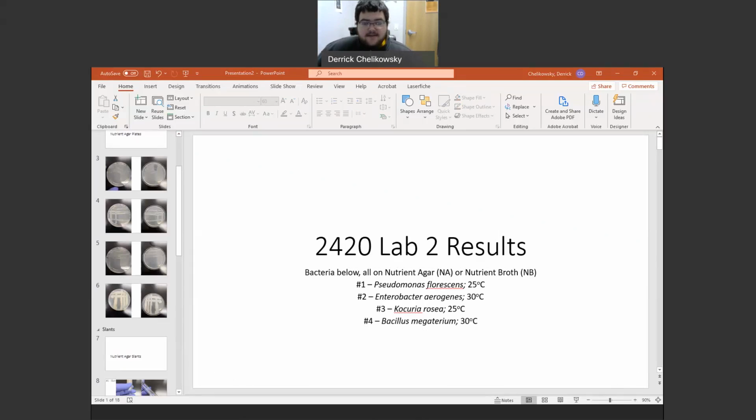I do have off to the side here your lab guides and handouts. So we are going to be going through lab guides and handouts, explaining exactly where things are. This is a template for the rest of the course as well, so that you have an idea of what goes where and when. The biggest thing that I can tell you is draw what you see.